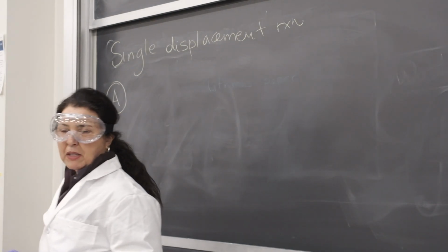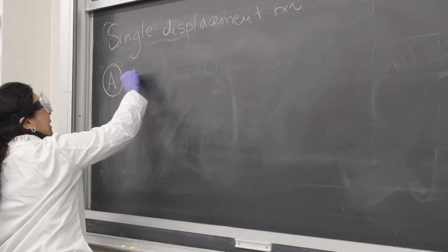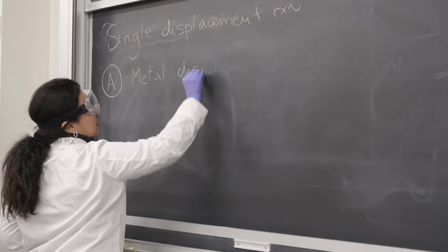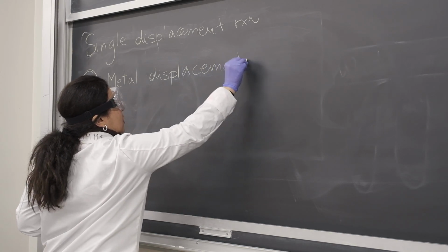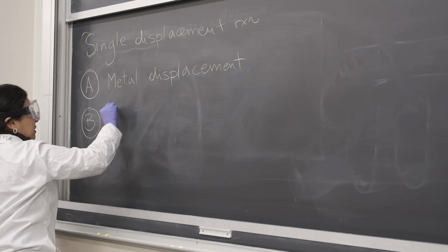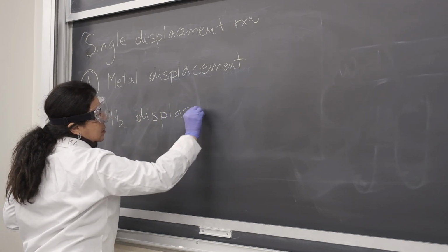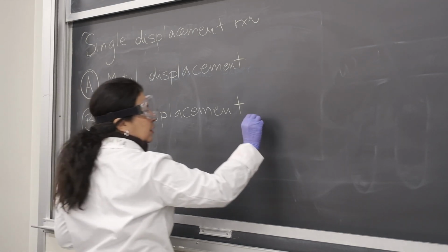Different types of single displacement reaction based on the activity series, right? We can have a metal displacement. We can have hydrogen displacement from water.